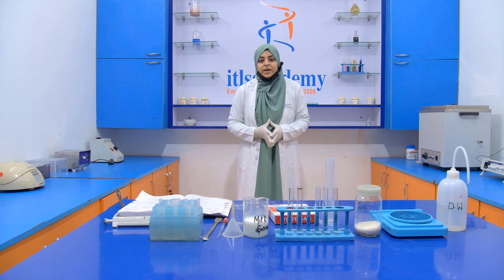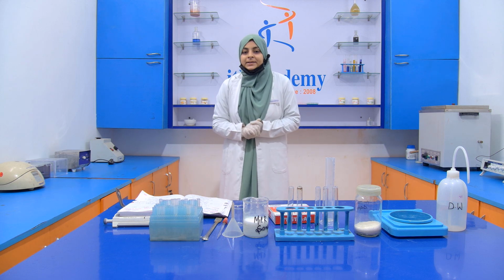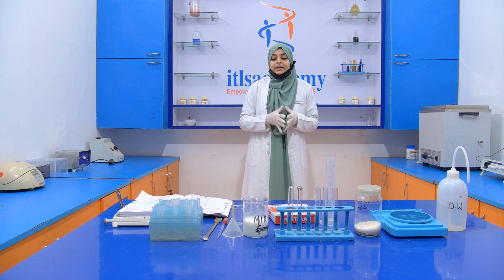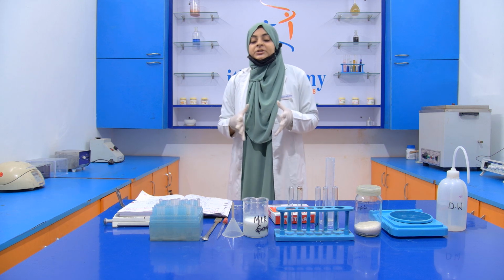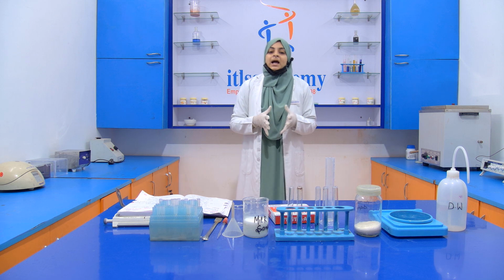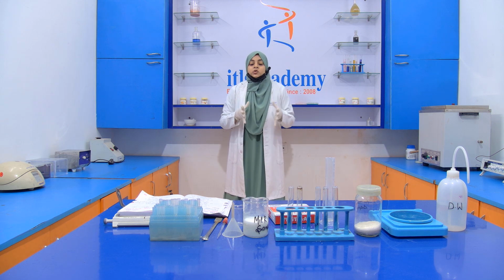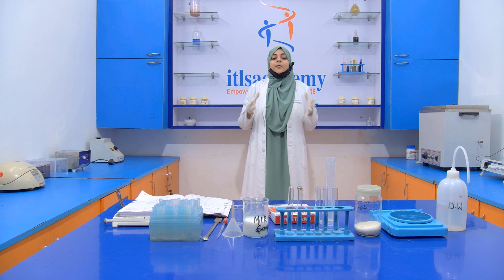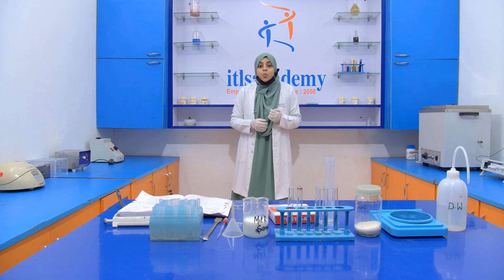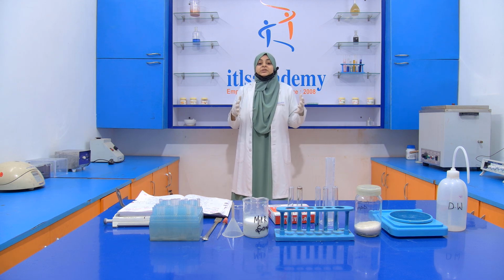Today we are going to perform another experiment, that is the turbidity test for checking the efficiency of the sterilization in liquid milk. So first of all, before performing this experiment, we have to know what sterilization means.